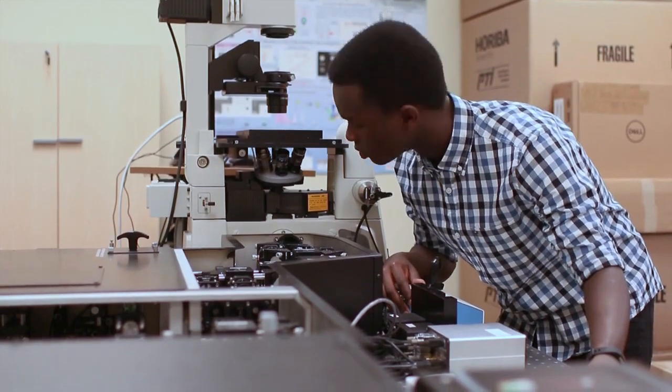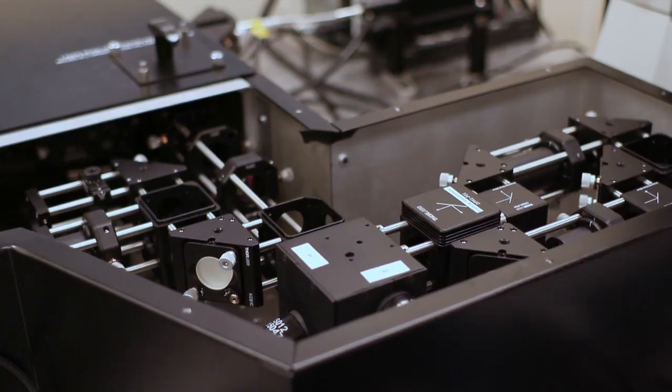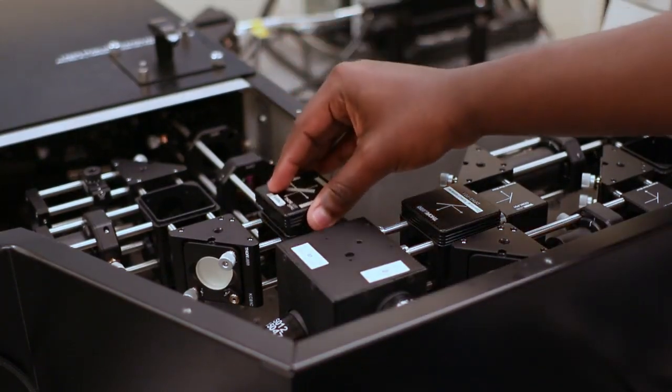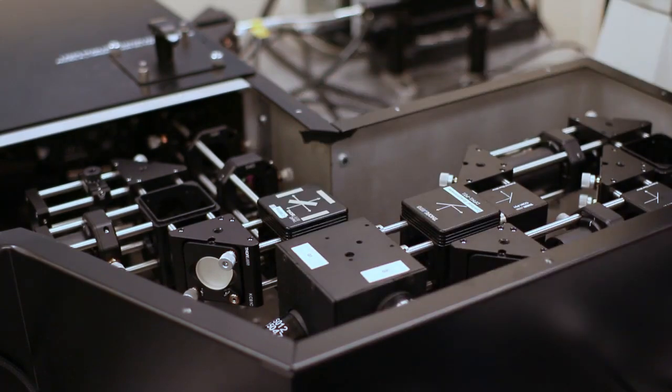Looking along the optical path toward the detector, place the visible optical cube containing the dichroic mirror and filters for directing the visible emission to the detection path in its position.